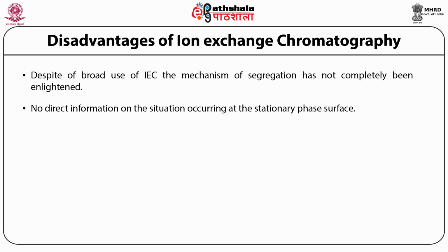One of the main disadvantages of ion exchange chromatography is that ion exchange columns must be loaded in low salt buffers because binding to ion exchange resins depends on electrostatic interactions between the stationary phase and proteins of interest.